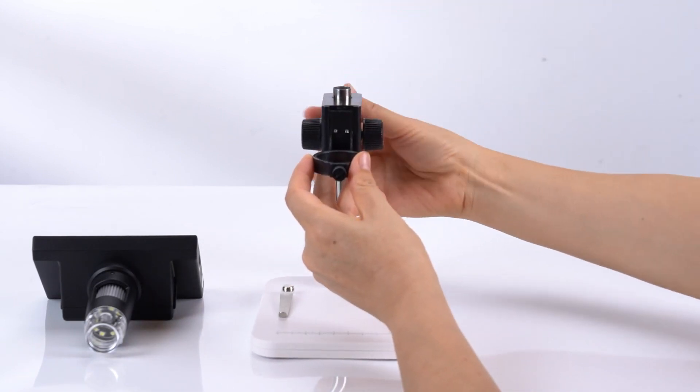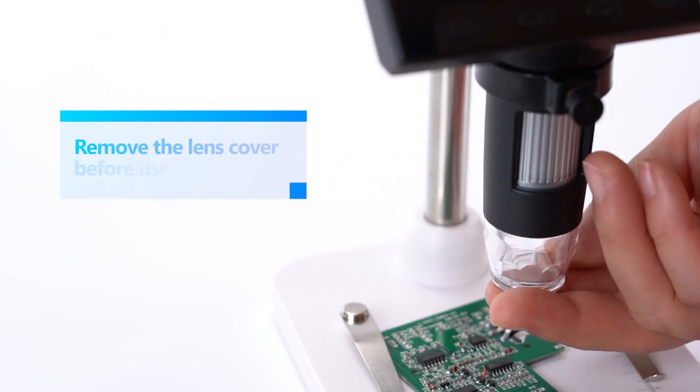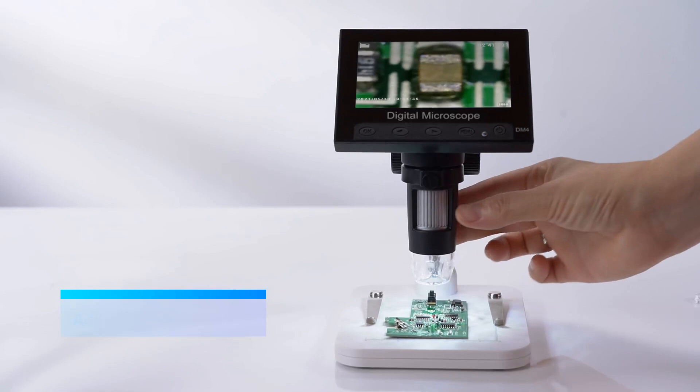The first thing you'll notice is the bright 4.3-inch LCD screen. This LCD screen provides a clear 720p HD live view, enhanced by eight adjustable LED lights, eliminating shadows and revealing fantastic detail.